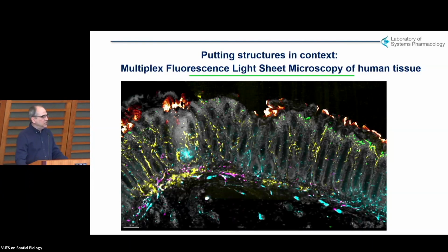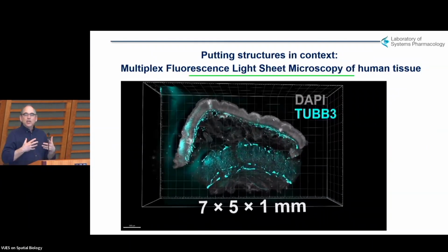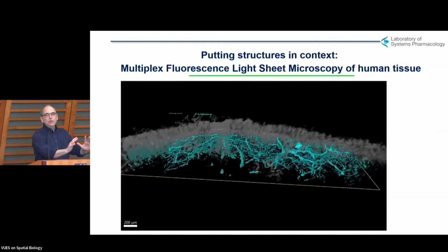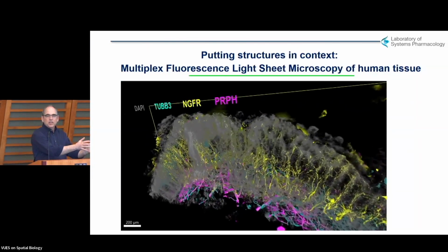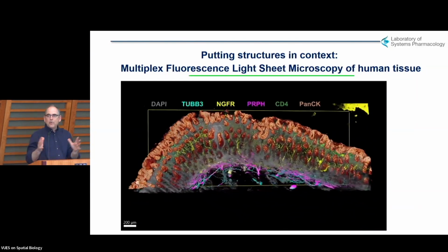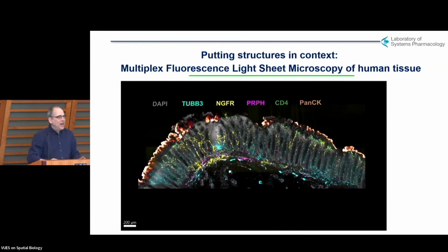And what's interesting about them, and I'll just play it for you one more time here, is that by going to the bigger spatial scale, we can see blood vessels, nerves, and all those things that are really invisible at small spatial scale. And so we think that the overall thing in the future could be micro CT, which actually can work at the centimeter scale, this which can work at the millimeter scale, and then the three-dimensional imaging that I showed you, the very high resolution that can work at the submicron scale, at the micron scale. And so those three embeddings, you're not going to have everything on everything. So we're going to need visualization that sort of jumps, sort of from like the continent to the city to the house.